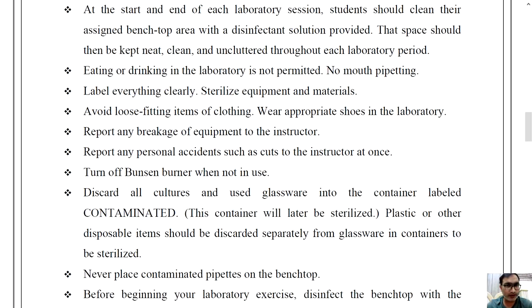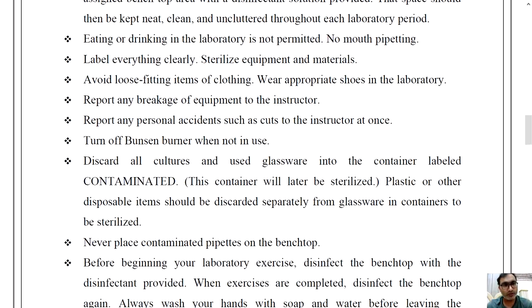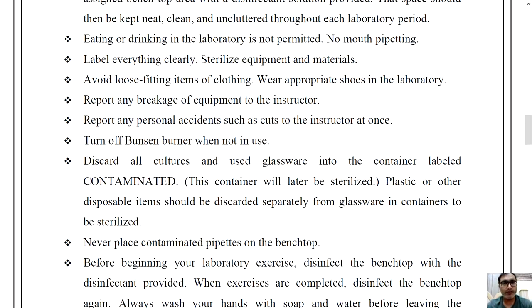Label everything clearly — whatever test tubes or materials you have, you must label them. Sterilize all equipment and materials you are using. Avoid loose-fitting items of clothing and wear appropriate attire in the laboratory.